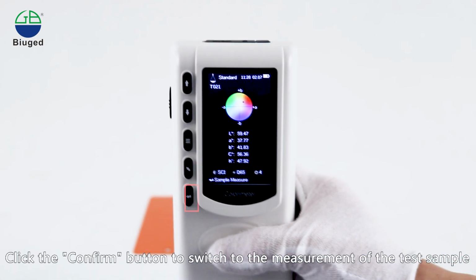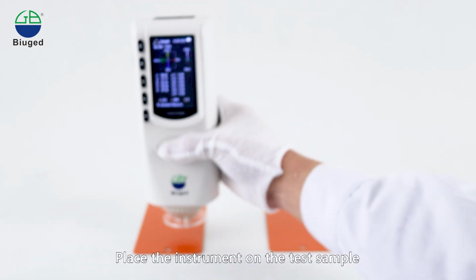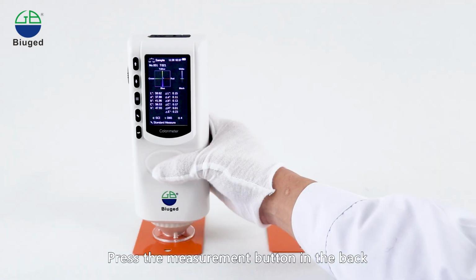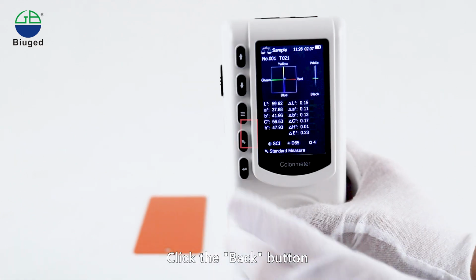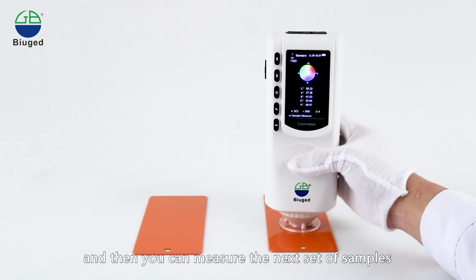Click the Confirm button to switch to the measurement of the test sample. Place the instrument on the test sample. Press the measurement button in the back. The screen will display the difference between the reference sample and the test sample. Click the Back button to return to the reference sample test, and then you can measure the next set of samples.